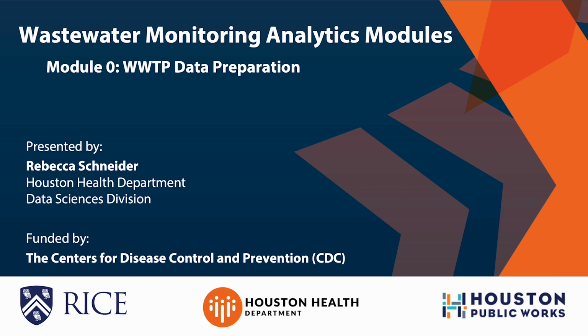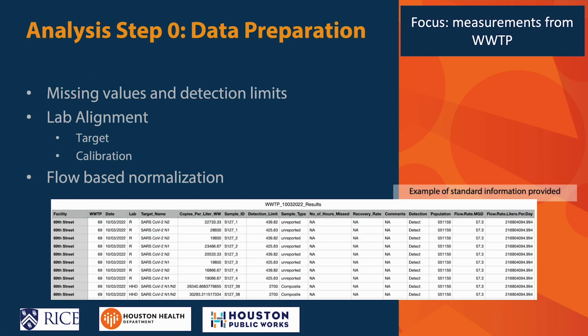I'm Rebecca Schneider, an analyst in the Data Science Division at the Houston Health Department, and I'm presenting on behalf of the Houston Wastewater Epidemiology's Analysis Team. We wanted to call this module Module 0 in order to highlight the steps before the analysis begins. In this module, we will cover missing values, lab alignments, and flow-based normalization.